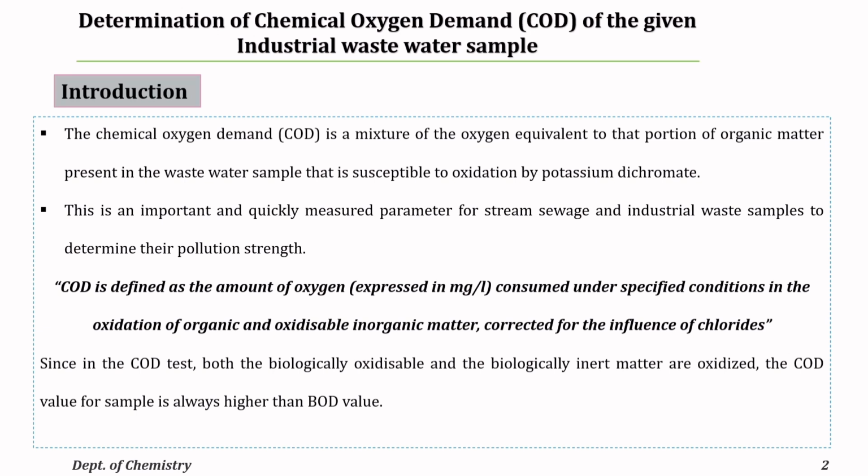It is the measure of the amount of oxygen which is required to chemically oxidize the organic and inorganic matter in the water. So COD is commonly used in environmental science and water treatment to assess the water quality or water purity and level of pollution, especially from industrial and municipal sources. A high COD value indicates a high concentration of oxidizable pollutants, which can lead to oxygen depletion in water bodies, which is definitely going to negatively impact aquatic life.